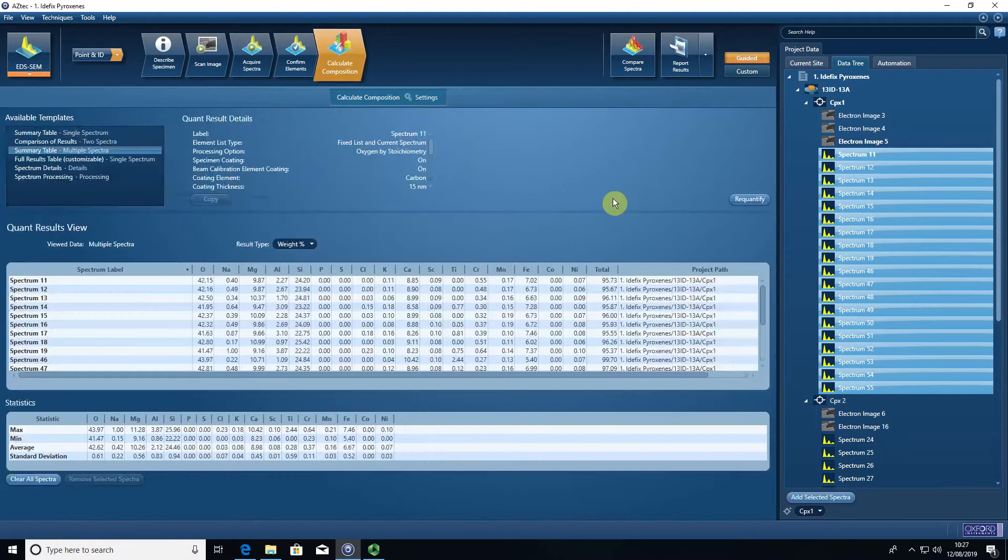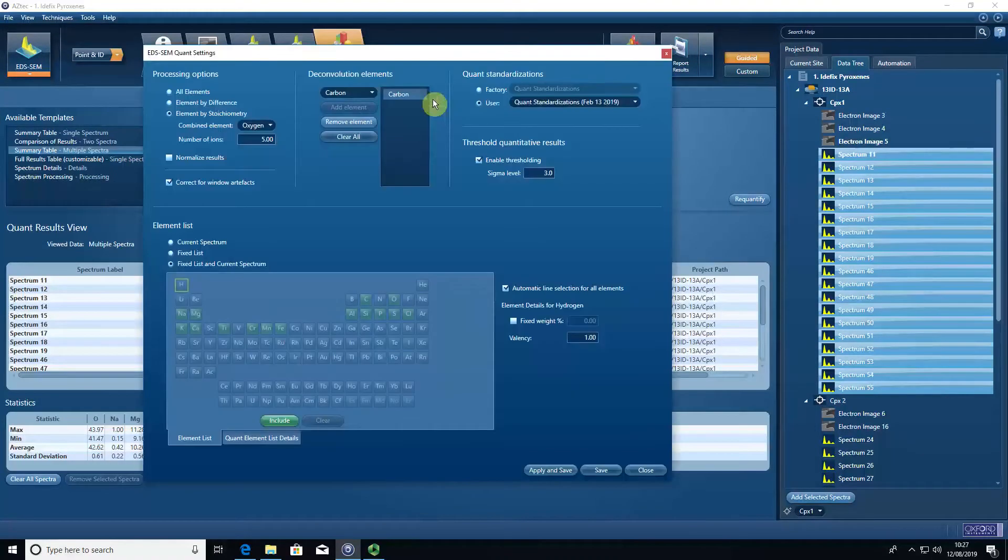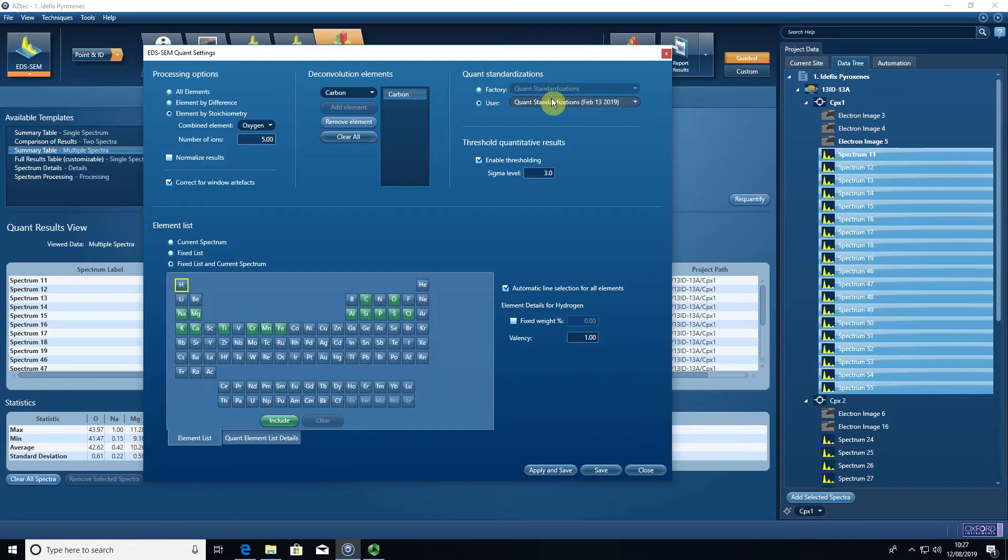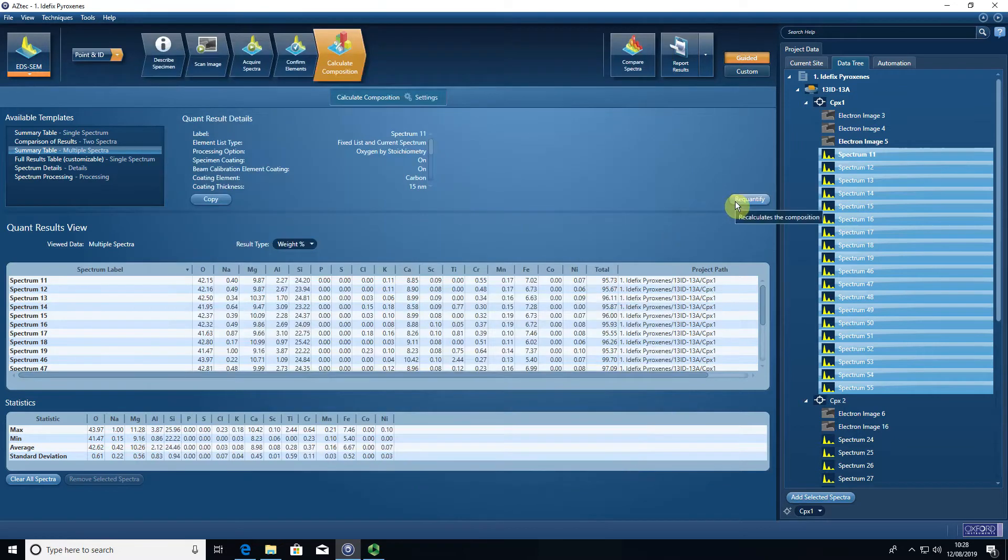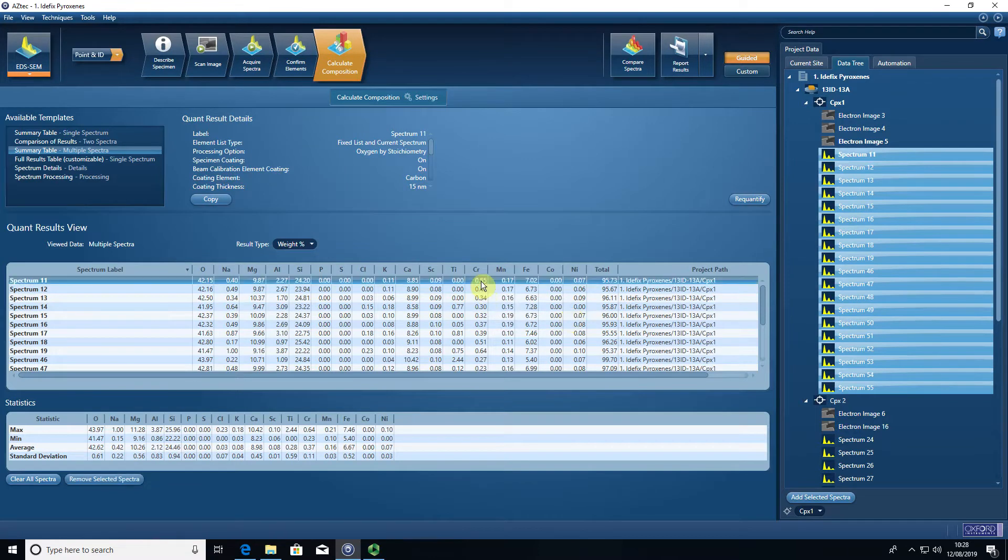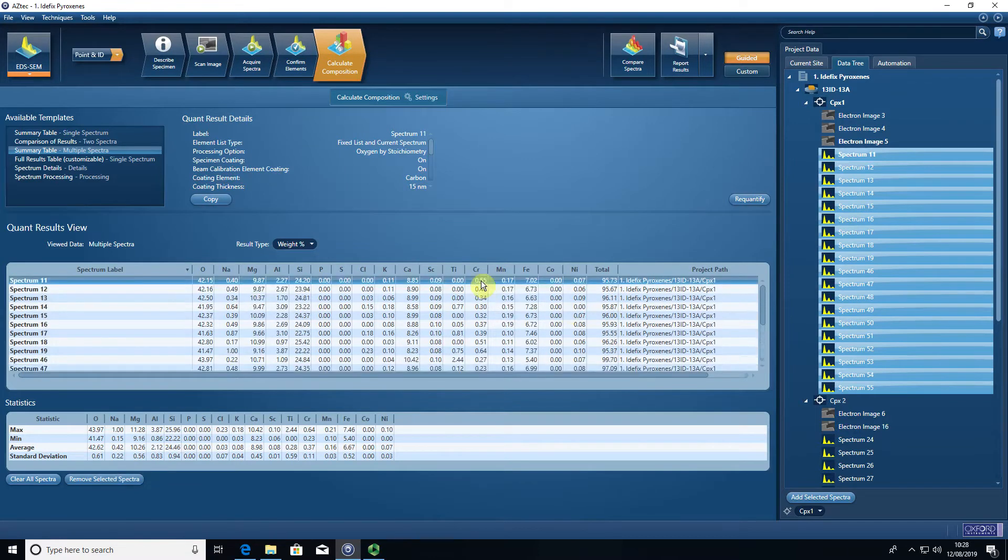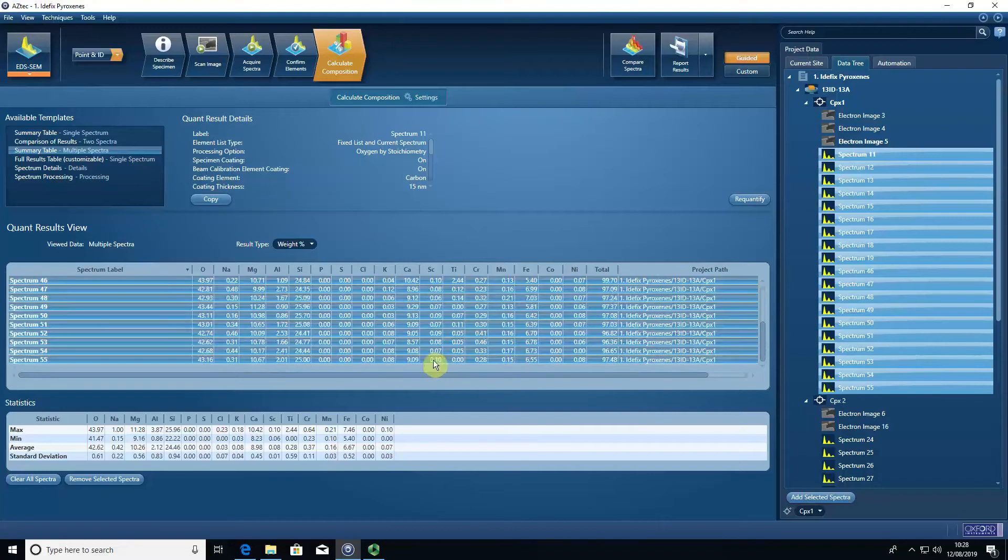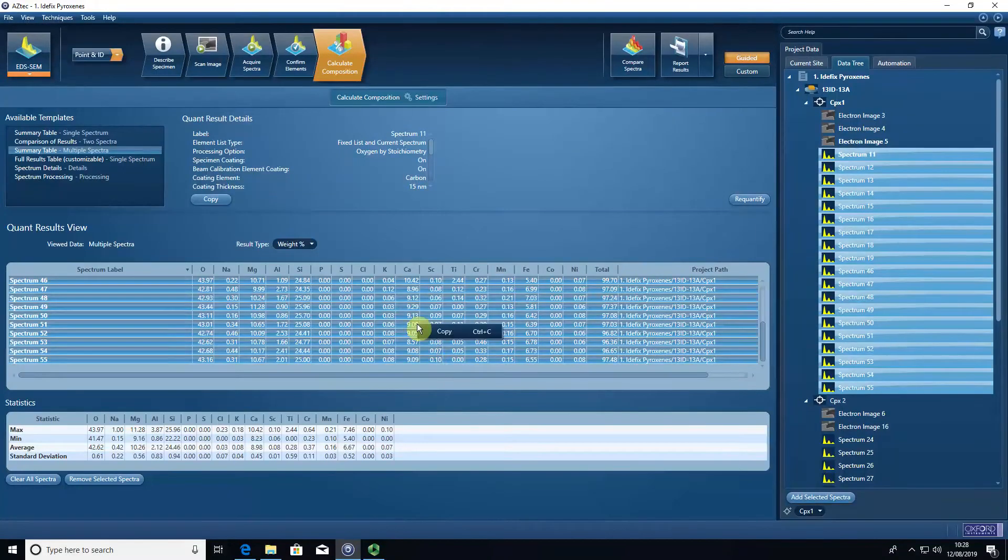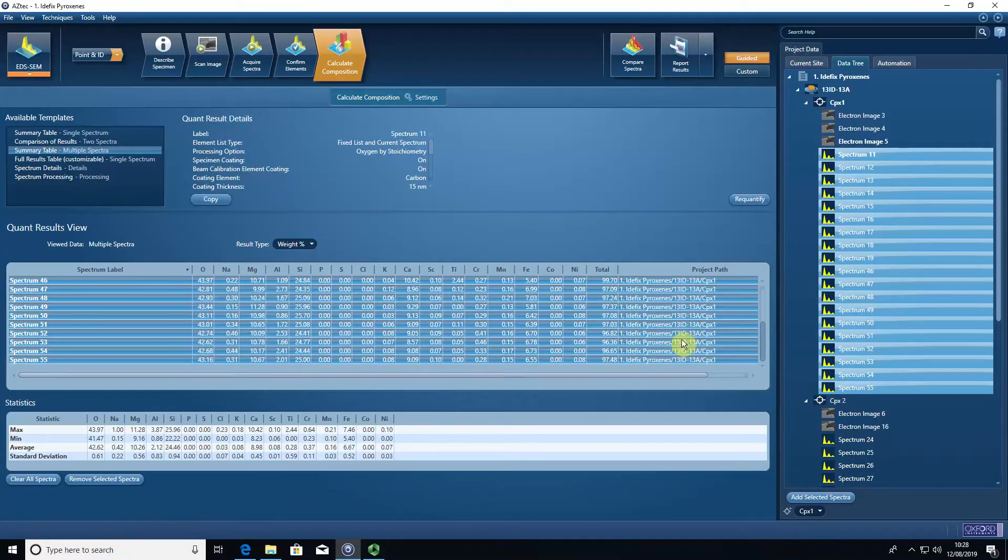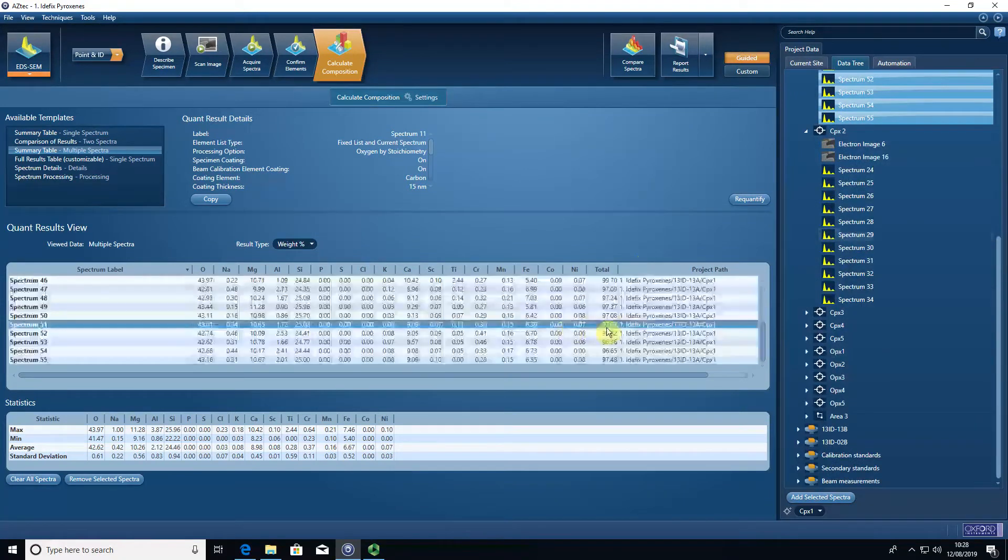Once you've ensured the pulse pileup correction is on and that you've got your settings correct—so with oxygen by stoichiometry, that we don't normalize the results, and that we have the correct standardization selected—I always press re-quantify before I export just to make sure it's updated. Then it's as simple as selecting the top spectrum, shift-select the bottom, you can copy the data, and then we can open Excel and just paste it in basically. You would do that for all of your spectra in this case.